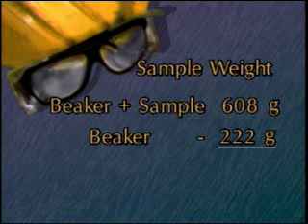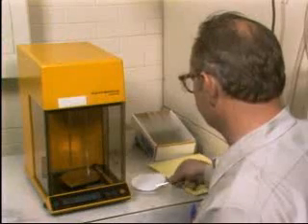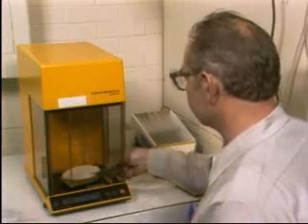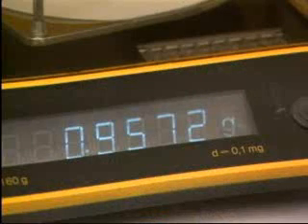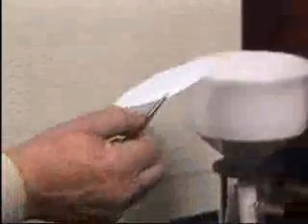The calculated weight of this sample is 386 grams. After the filter paper is dried for the specified amount of time, it is weighed. This particular filter paper weighs 0.9572 grams. Next, the filter paper is placed in a funnel.